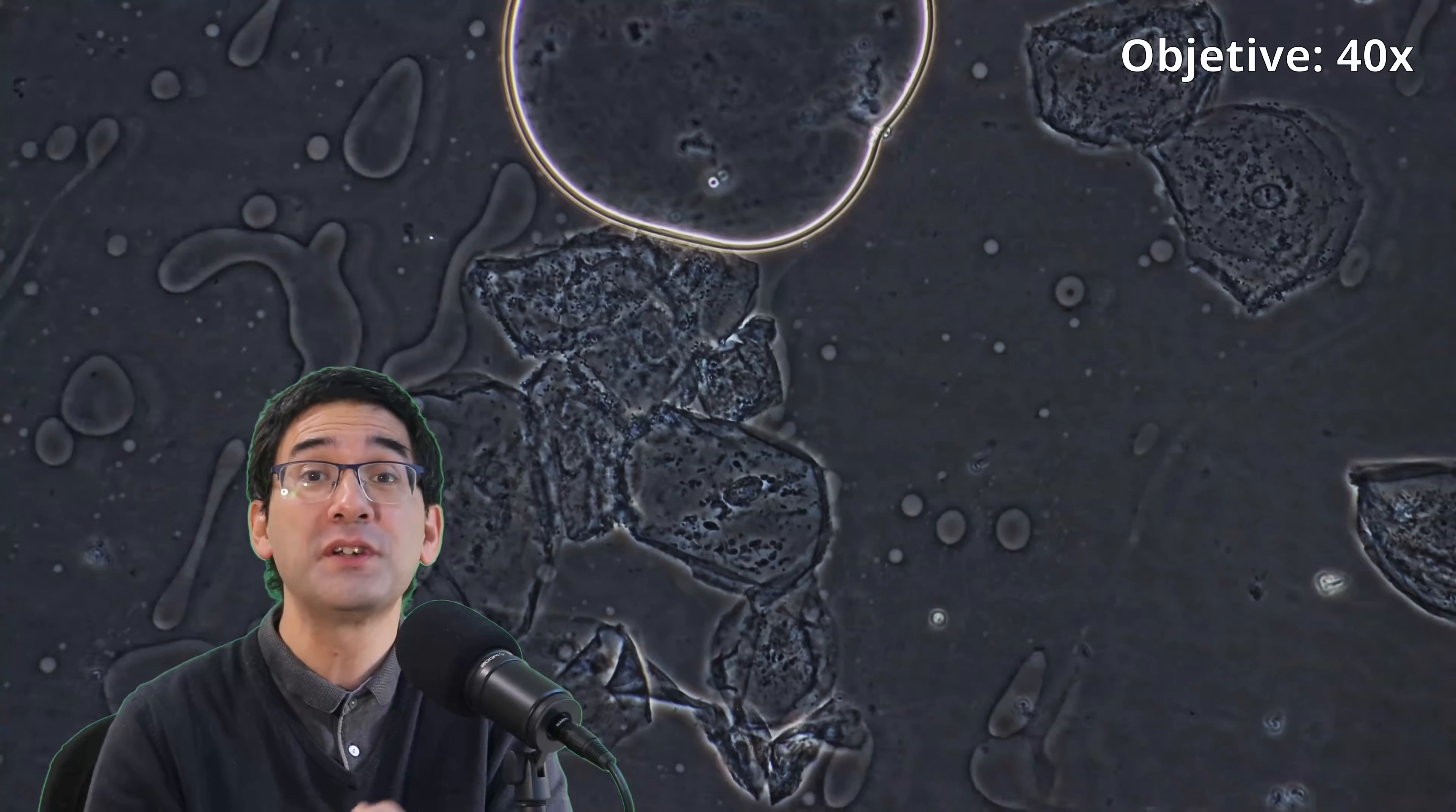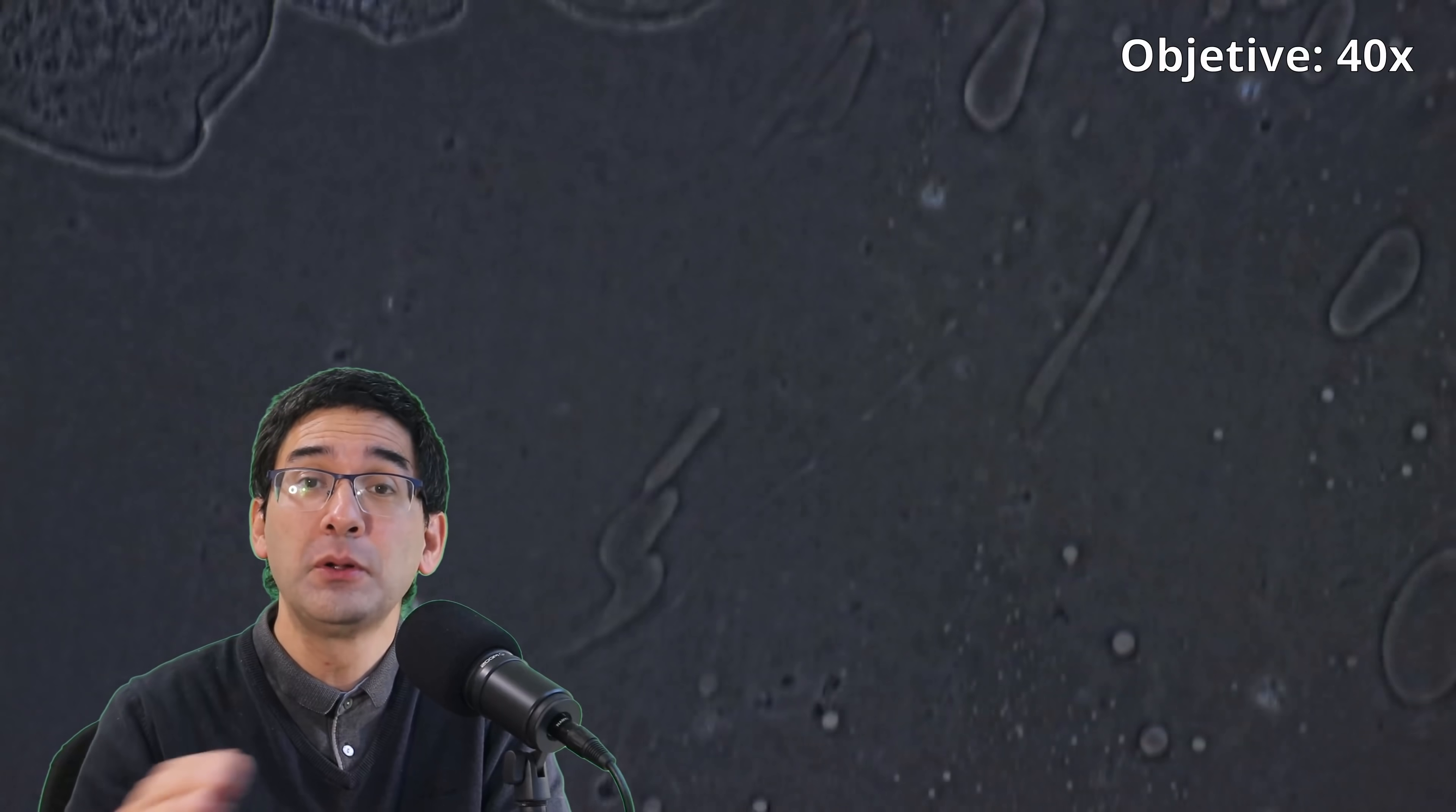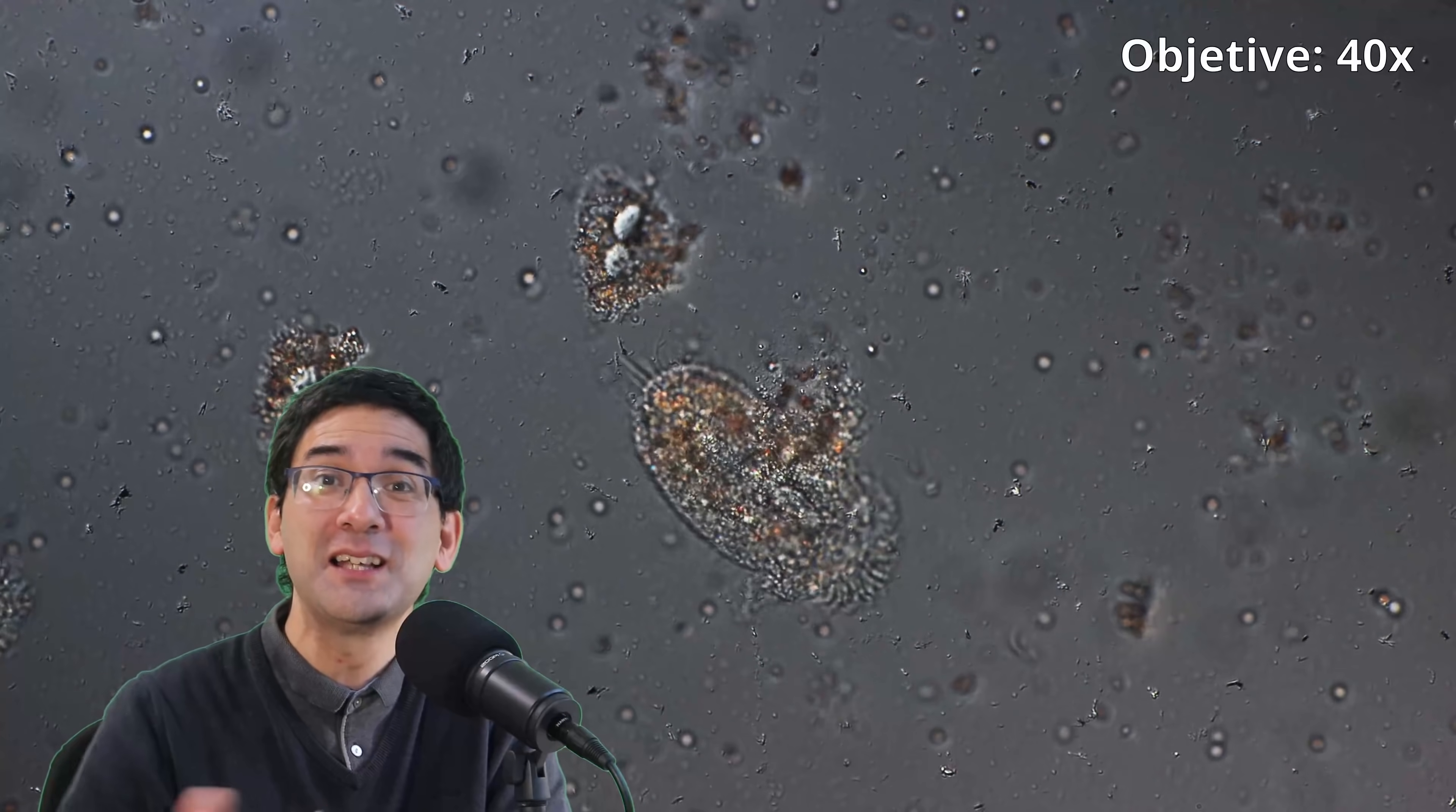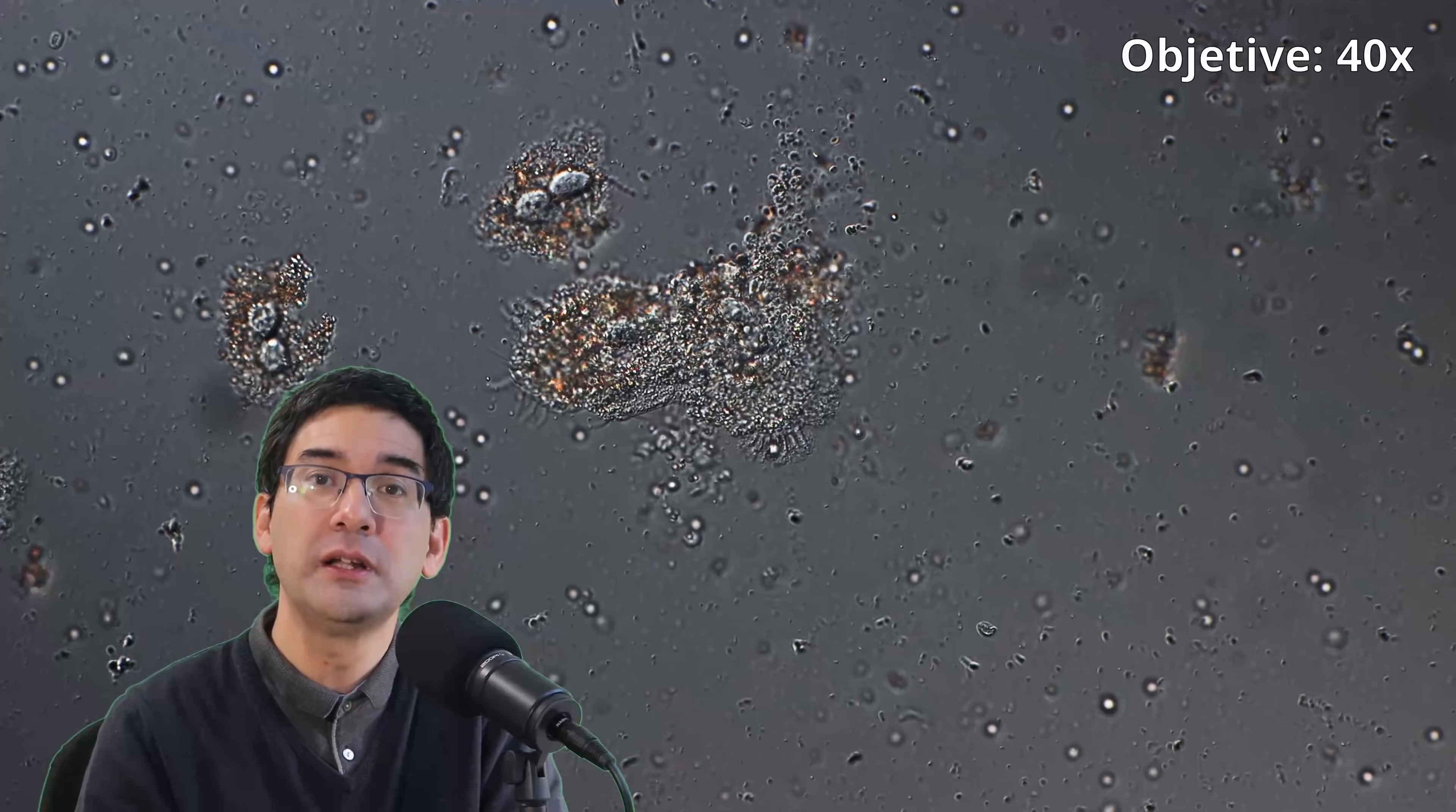Actually, that makes a lot of sense. Because the human cells have to be stable enough that they don't lyse, that they don't break open when you, for example, drink alcohol - because alcohol otherwise also would be able to dissolve cell membranes. Or soap, for example, on our fingers and hands. The soap should not dissolve away the cell membranes. This would be a big problem because then the cells would die off. So it is kind of clear that human cells must evidently be a little stronger and more stable.